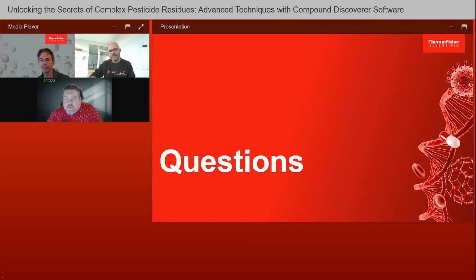All right, and one more for you. Why were the mentioned M3 extraction samples positioned on different axes in the PCA if both sample clusters were produced with beads?